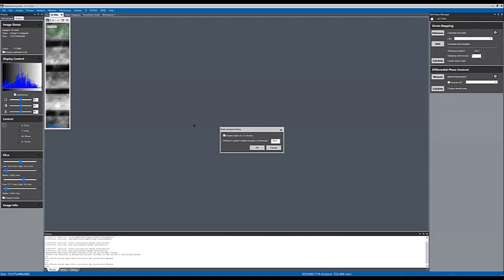In this example, I have measured negative 35 degrees. So when I calculate the strain in the diffraction direction, it is going to rotate it so that when I get the X and Y strain maps, I get them in the X and Y directions of the scan of the real space in the sample.